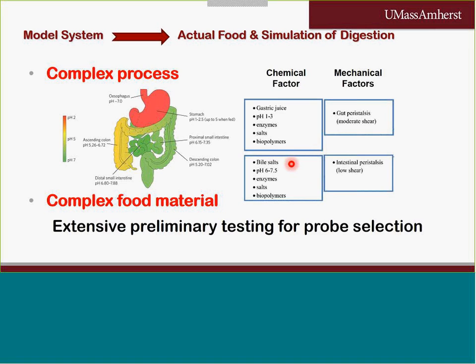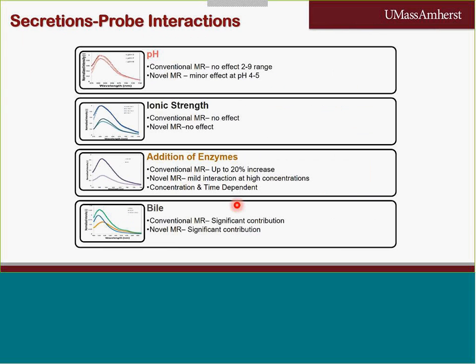And in terms of mechanical factors, you have periodic movements which also affect the performance of an inline measurement. So in order to avoid false conclusions, we performed extensive preliminary testing for selection, testing the sensitivity of our molecular rotors to pH, ionic strength, addition of enzymes, and addition of bile.